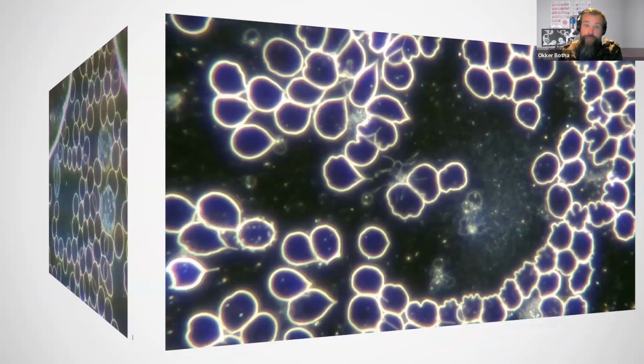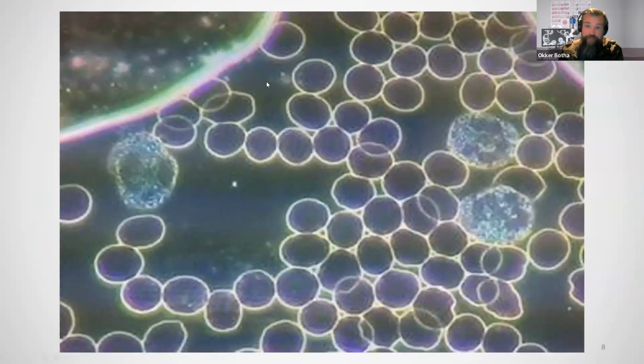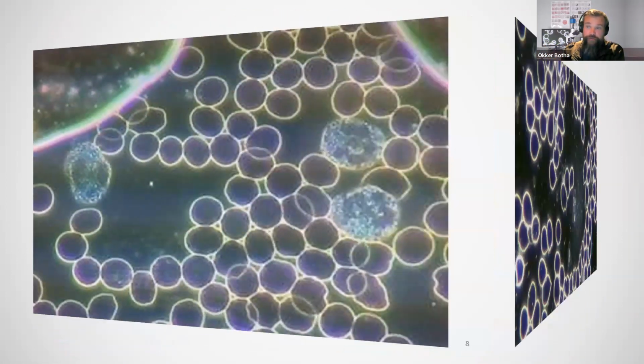There would actually be lots of interesting things visible here. We have a thrombocyte there. There definitely would be things around there that we would be able to see. Also in most dark field samples, across the board, we would see some small motile, moving particles between the cells called chylomicrons. And those we see usually in most samples. So if you're looking at a dark field sample and you're not able to see any small reflective spots between the cells, that's already a sign that the microscope doesn't have what it should have for dark field.